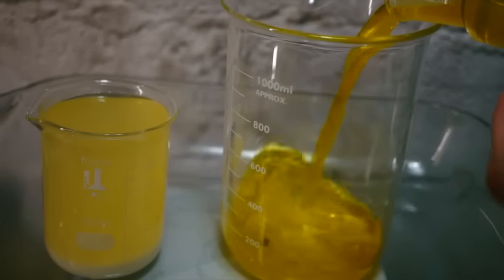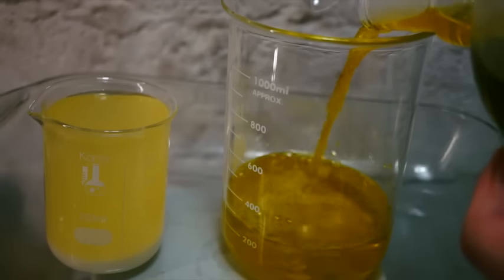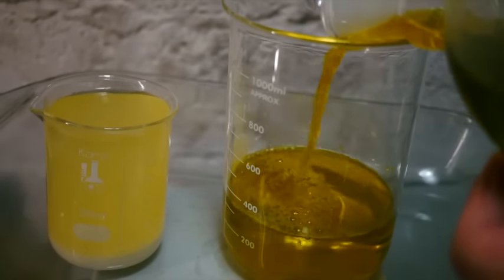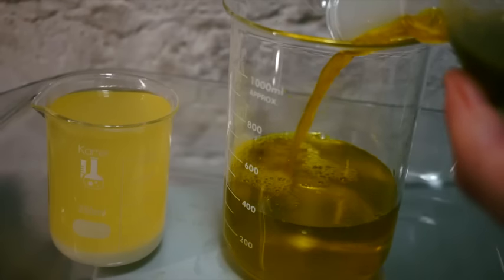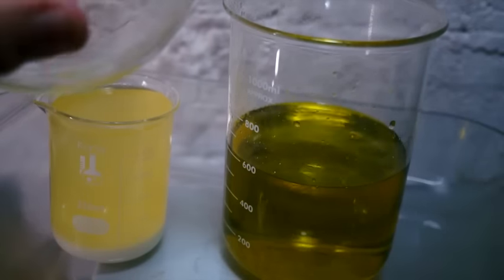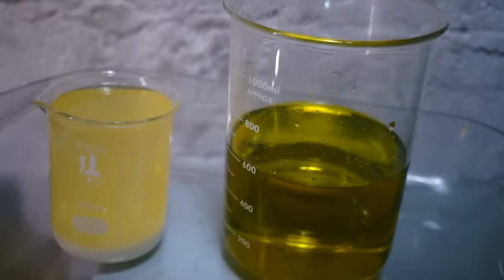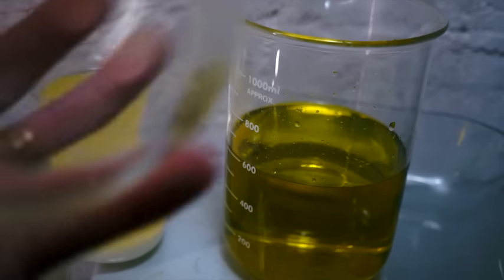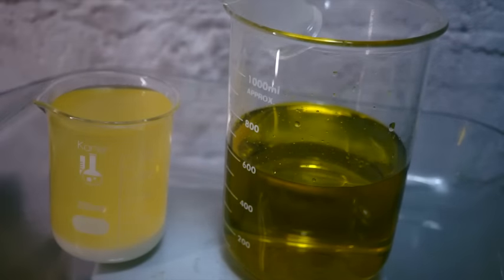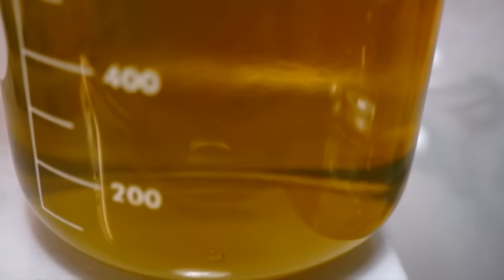Now we will add our filtered gold solution to a large beaker. Be sure to rinse your flask, as this solution contains gold. Now, we will add the saturated sodium metabisulfite to the gold-bearing solution.